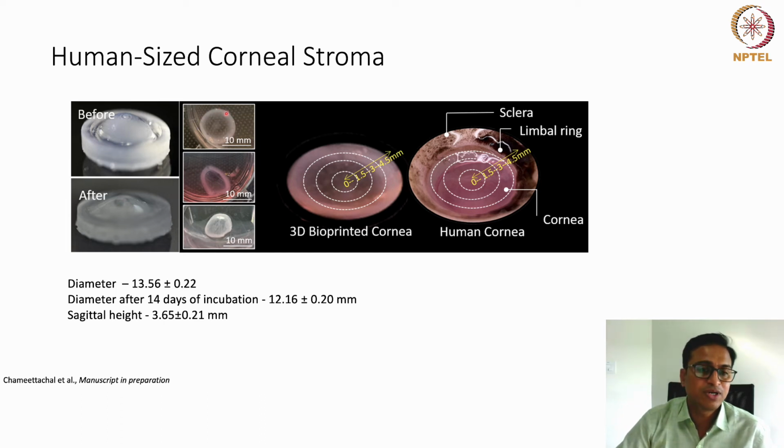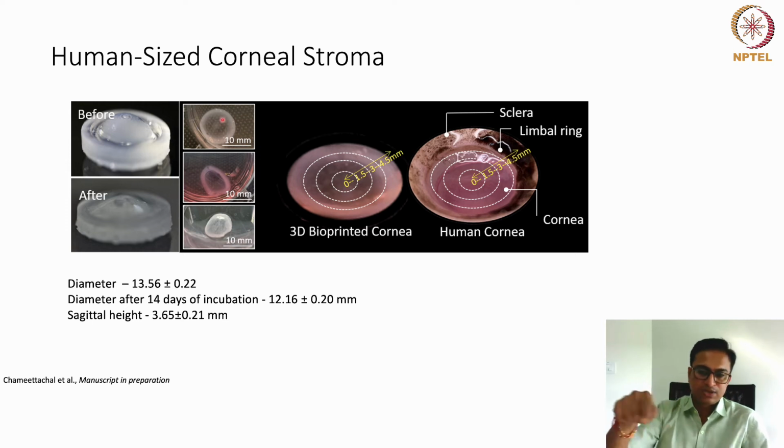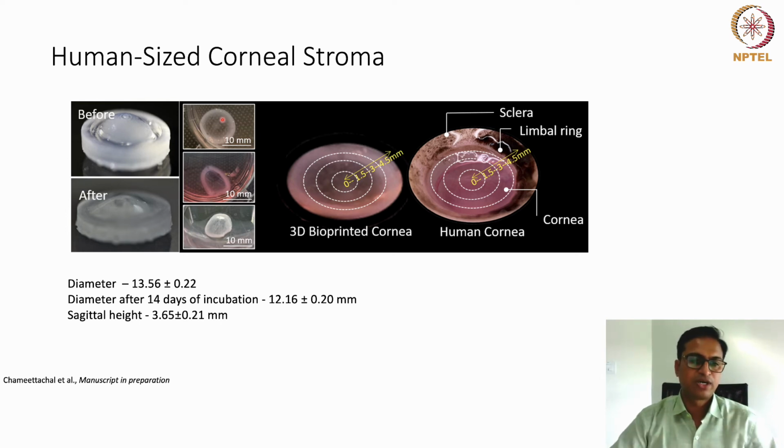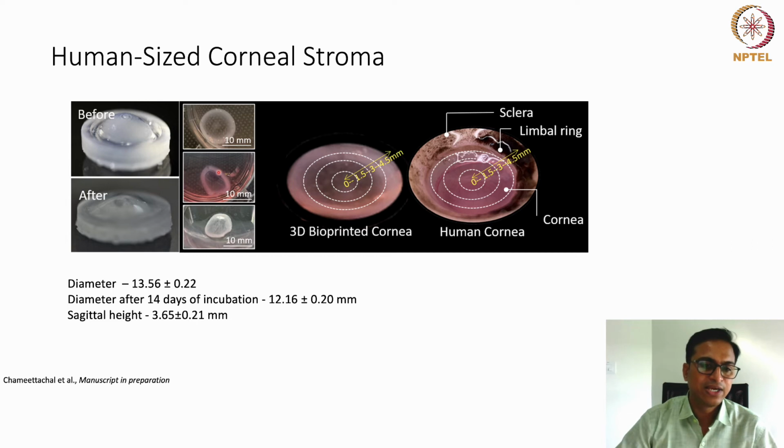One important finding from this study is that we can produce corneas where the central part is thinner than the peripheral part. The peripheral parts are thicker, and because of that, you see here the middle part of the cornea is more transparent. It is also very good for handleability, because if the outside parts are thicker, you can maintain the shape of the cornea, and it is also very good for handling. So if you look clearly, this is the printed structure, this is the bioprinted cornea.